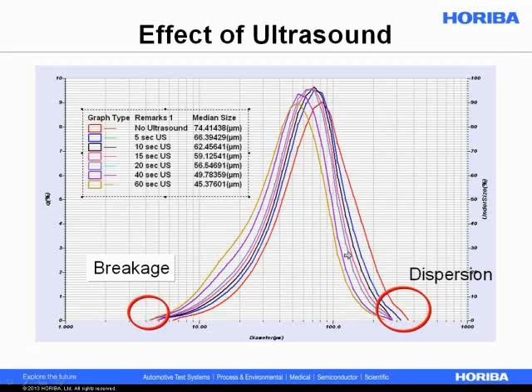So we would probably want to do a study of what is the optimum amount of ultrasound to get good dispersion without breaking particles. This is not a method development webinar tonight. If it were, or if you wish to see one, there's one on the website, and it would talk about using the Method Expert software in the LA950, which automates these kinds of studies, rigorously looking at increments of ultrasound, the effect on results, and choosing the optimum amount. But it is very important to use the optimum amount of ultrasound when dispersing powders in liquids.